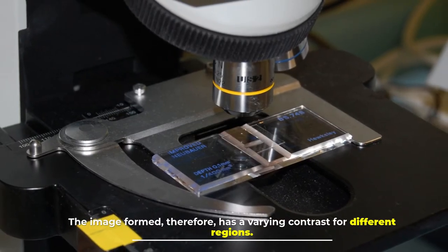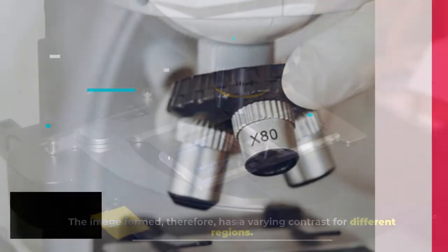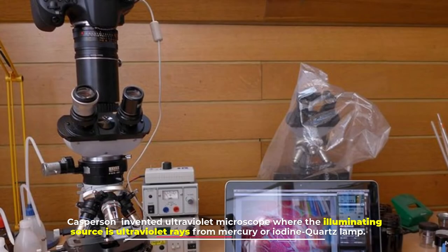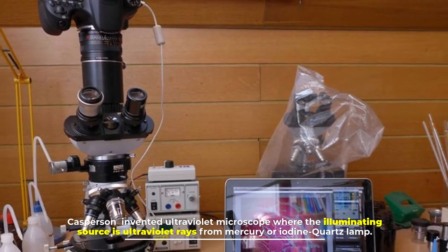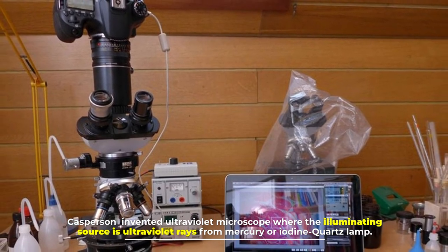Number three: ultraviolet microscope. Caspersson invented ultraviolet microscope where the illuminating source is ultraviolet rays from mercury or iodine quartz lamp. Image is captured on photographic film.